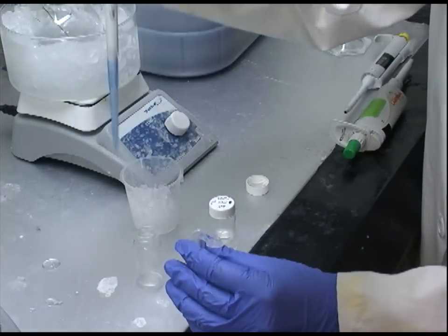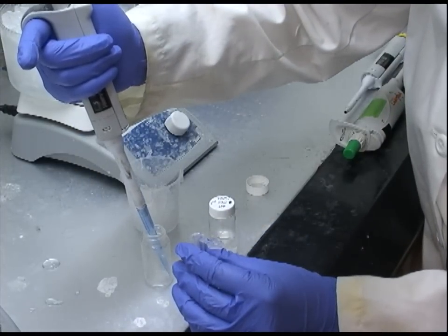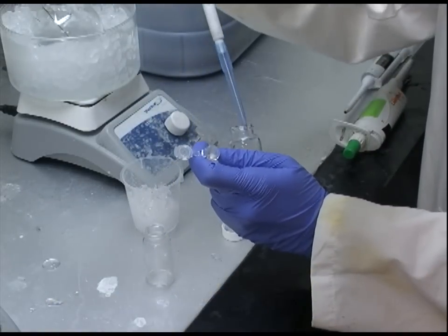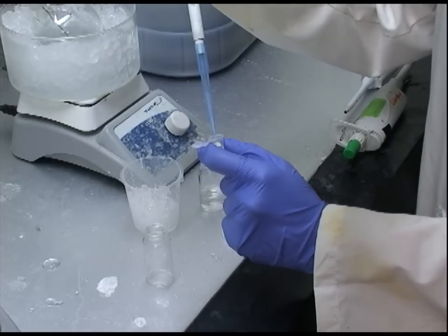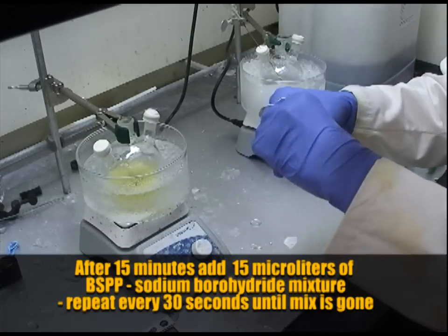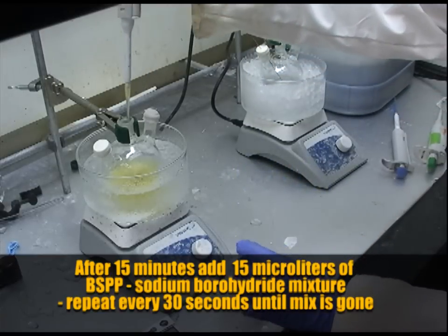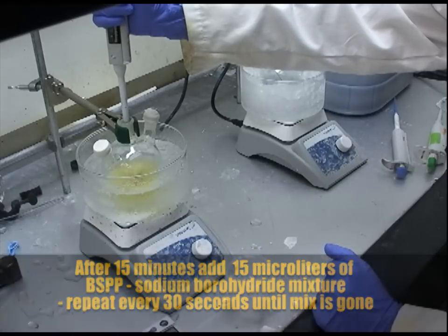We mix together the two stock solutions of BSPP and sodium borohydride: 1 milliliter of BSPP and 500 microliters of sodium borohydride, put together on ice. At 15 minutes we add 15 microliters of this mix to our solution, and repeat every 30 seconds until all of the mix solution is gone.